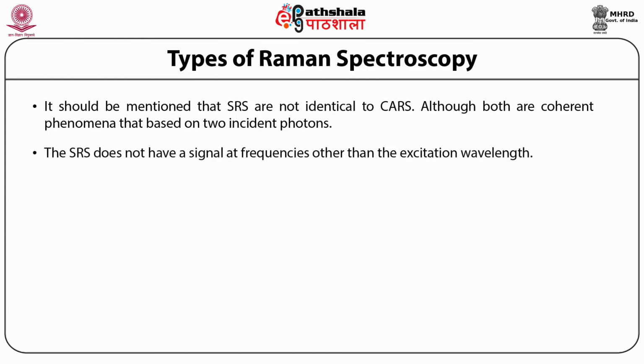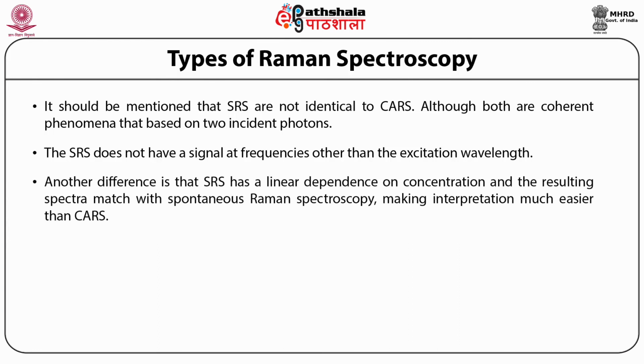The SRS does not have a signal at frequencies other than the excitation wavelength. Another difference is that SRS has a linear dependence on concentration, and the resulting spectra match with spontaneous Raman spectroscopy, making interpretation much easier than CARS.